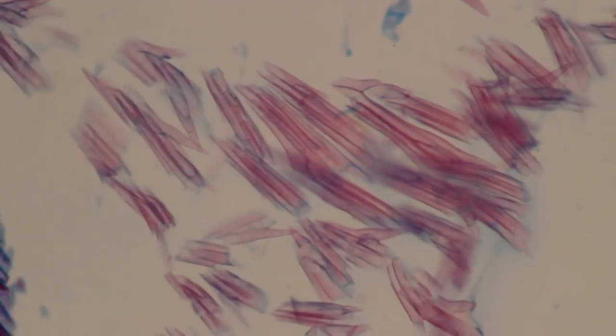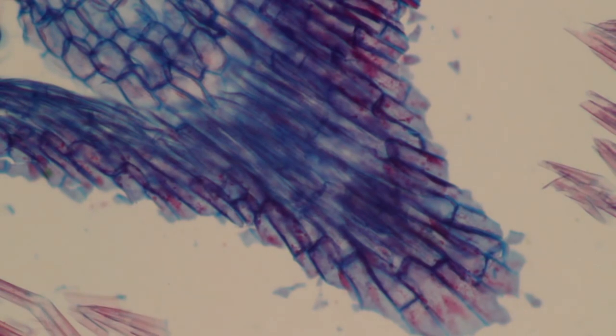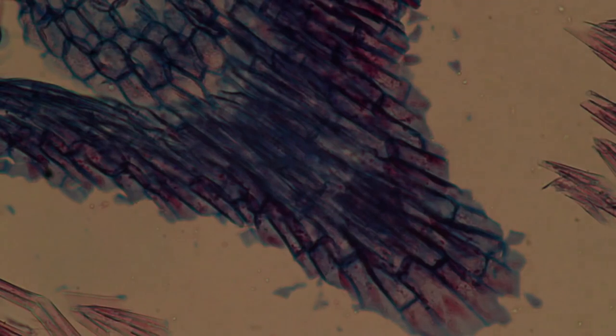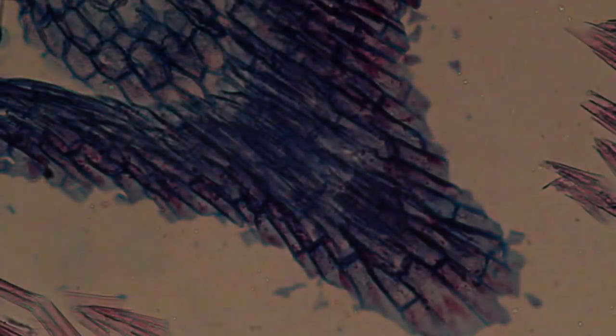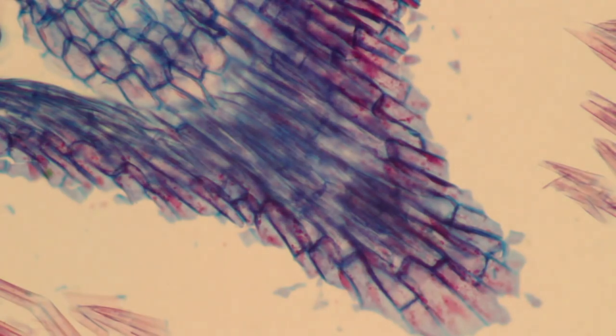At this point I'd like to show you the effect of the condenser aperture diaphragm. Right now the condenser aperture diaphragm is halfway open. When you close it, you can see that the image becomes darker and the contrast increases. When you open the condenser aperture diaphragm, the image becomes brighter — though the camera compensates exposure a little bit so the effect is not as noticeable. You can then use the light intensity control on the side to adjust the brightness separately from the aperture diaphragm.